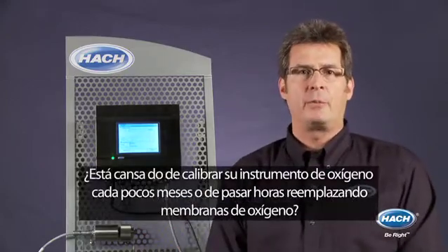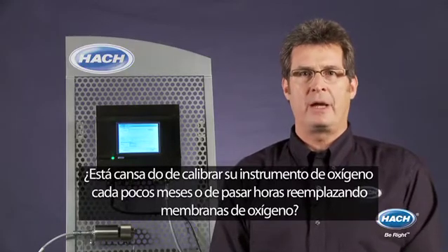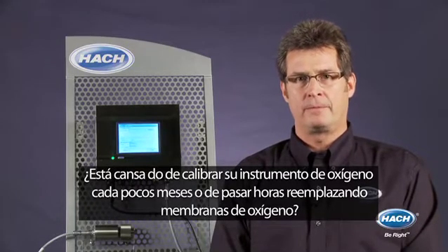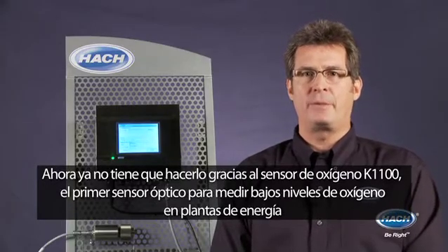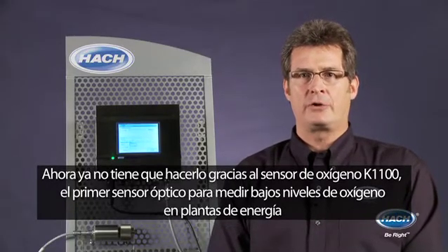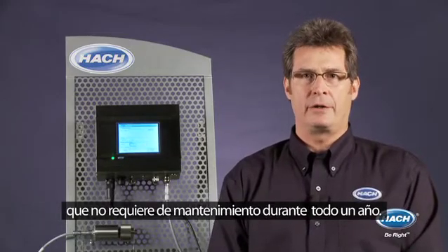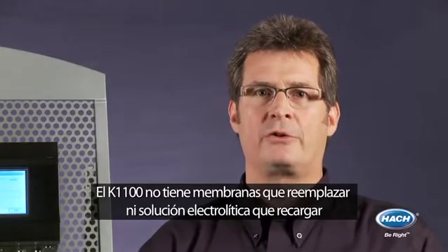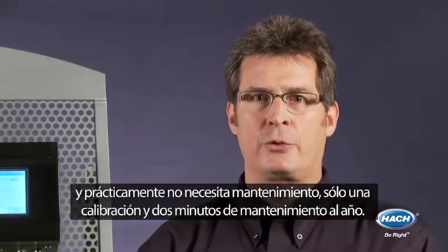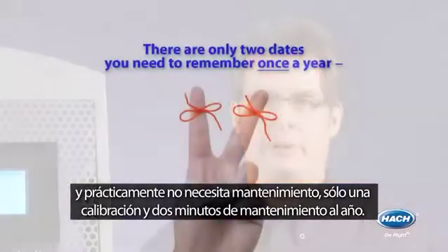Are you tired of calibrating your oxygen instrument every few months, or spending hours on sensor maintenance and replacing membranes? Now you don't have to, because the K1100 is the first optical sensor to measure dissolved oxygen down to one PPB that requires no maintenance for an entire year. K1100 has no membranes to replace or electrolyte solution to replenish, and is virtually maintenance-free, requiring only two minutes of maintenance and one calibration every year.